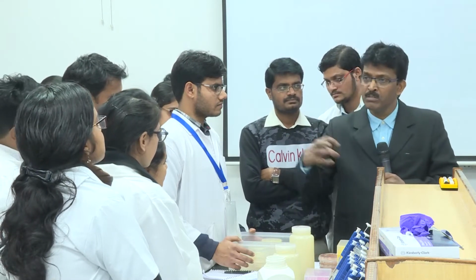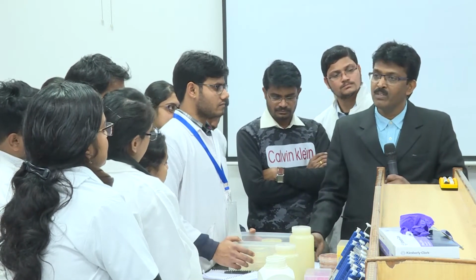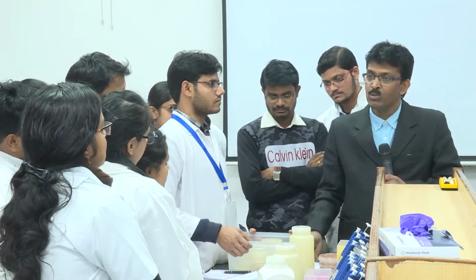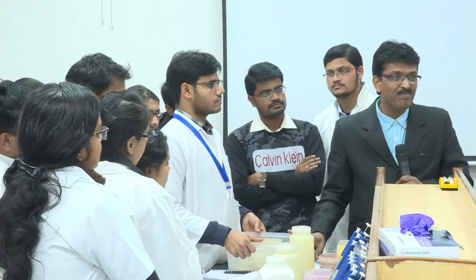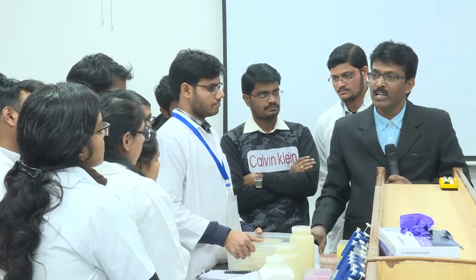You have to reduce the workload on a daily basis. So if you prepare around 30-40 plates, it's a one-day job, right? Similar work, coordinated effort. So it is easy to prepare 2 liters of media and 1 liter of media with the same effort. You understand? So prepare the plates and pour the plates, then keep them in your lab, right?